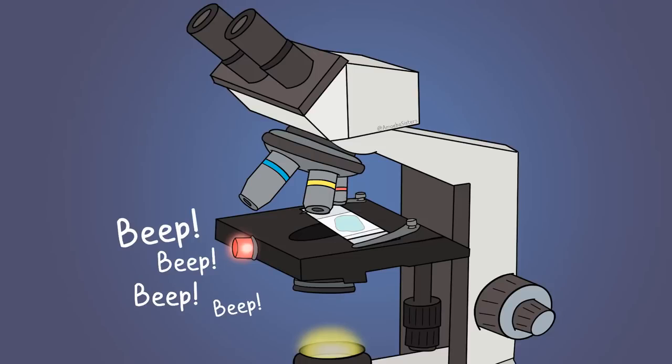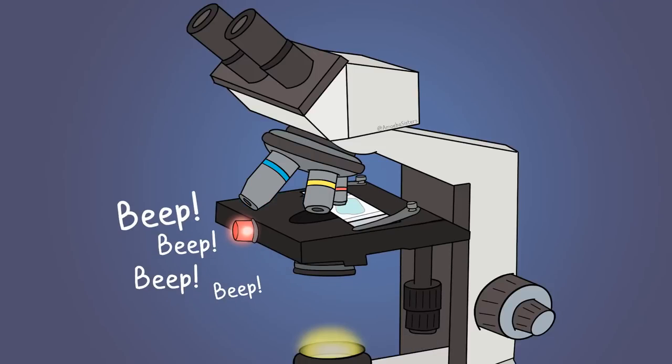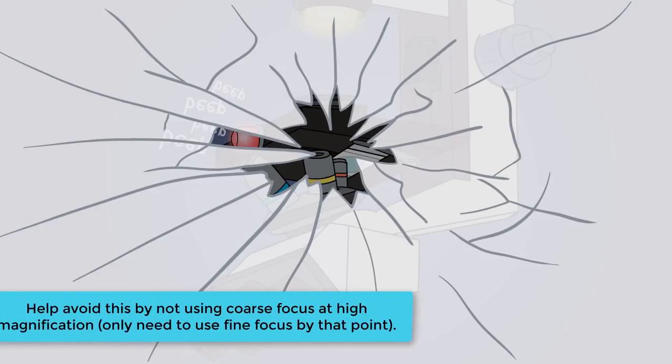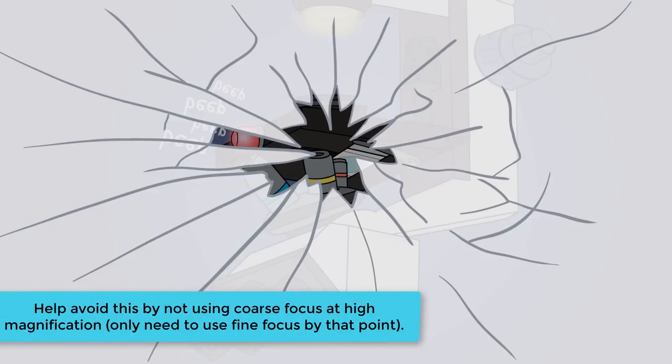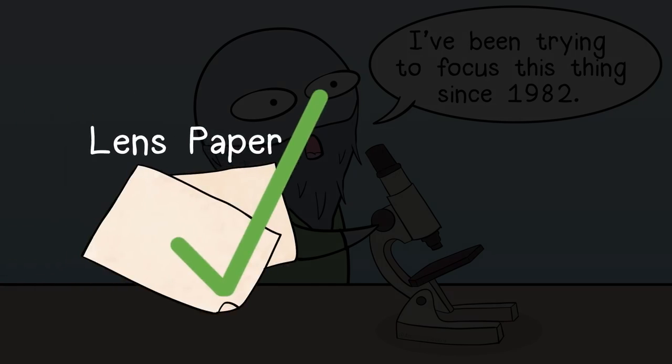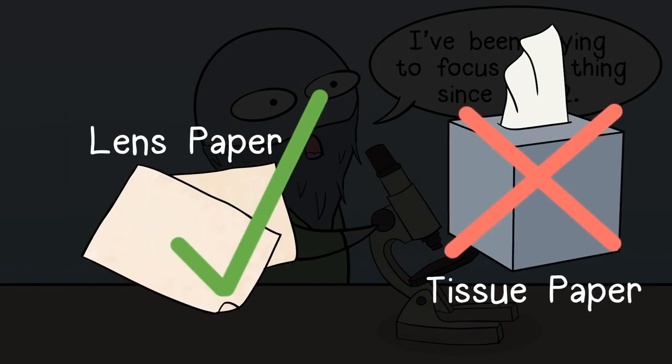Number 2, always be aware of where the slide is when you're moving the stage up and down with the focus knobs. It's possible to move the stage too close to the objective lens and actually crush the slide. And number 3, if it's hard to see your image even when focusing, you may need to clean the lens. But you need to do this by wiping it with lens paper, not regular tissue.